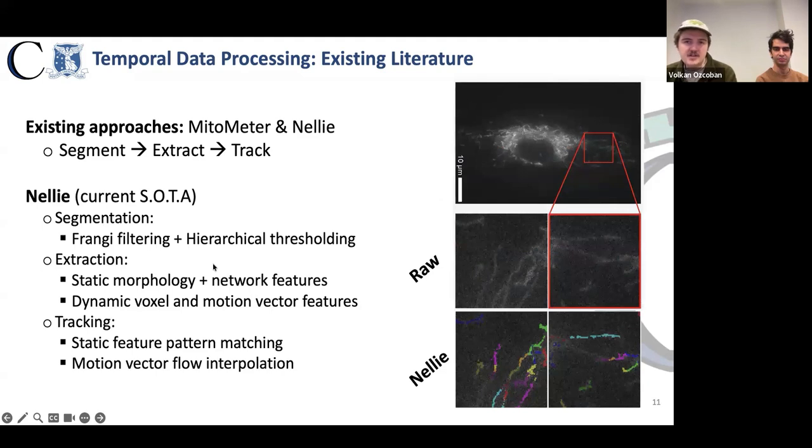Unfortunately, for our photogentle data, their approach doesn't work. The low wattage illumination required to stop photobleaching causes a very low signal to noise ratio. And their first step, algorithmic segmentation, produces low quality masks. With both feature extraction and tracking downstream of these masks, errors quickly proliferate and it creates an unusable output.